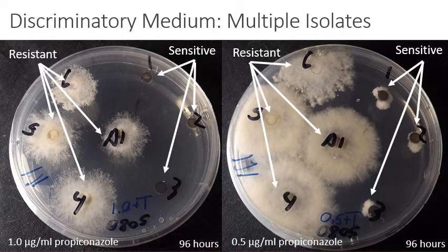From this test, we determined that media amended with propiconazole to concentrations between 0.5 and 1.0 micrograms per milliliter was potent enough to inhibit sensitive isolates of the dollar spot fungus, but not too potent as to stop growth from resistant isolates. This concentration of propiconazole, along with antibiotics or a weak acid to prevent some bacterial growth, is what we consider to be the preliminary discriminatory medium.